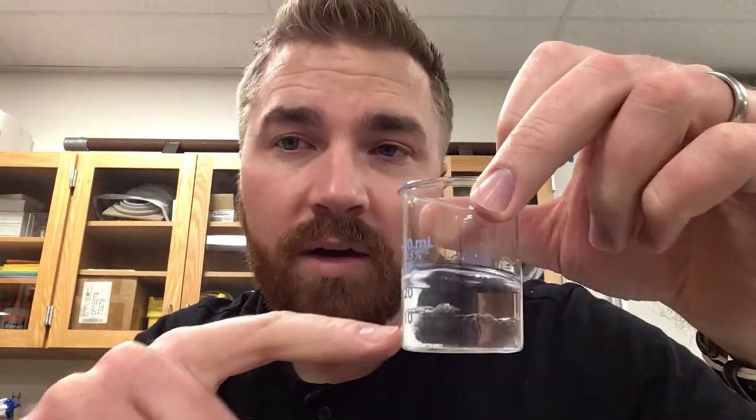As many of you should have guessed by now, that's liquid water from the ice melting. As the ice melted into liquid water, it's down here, and we know that ice floats on liquid water. So we have liquid water, then our ice, then our unknown solution. What's our 4th one? That's right, it's the air above that unknown solution. Now for the sake of time, because this is getting to be a longer video already, that unknown solution is alcohol. Some good old isopropyl rubbing alcohol.